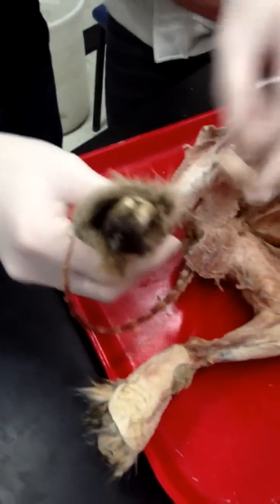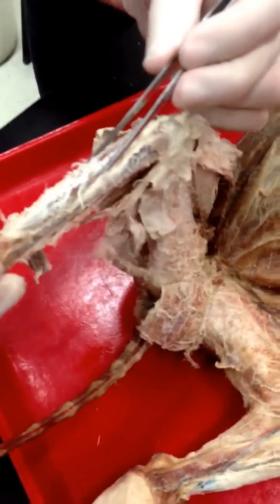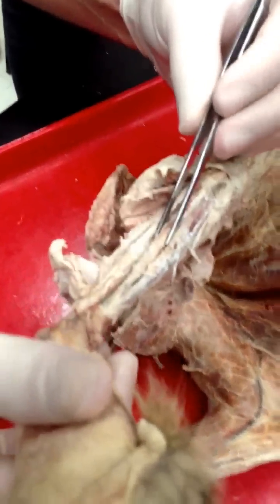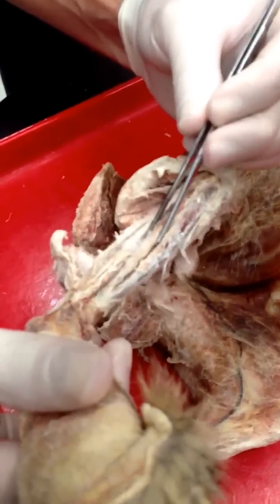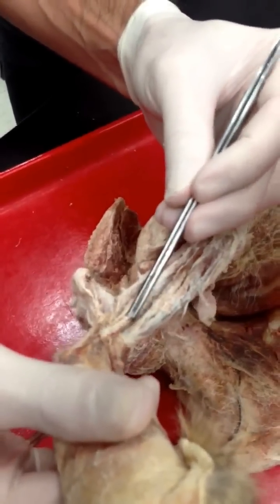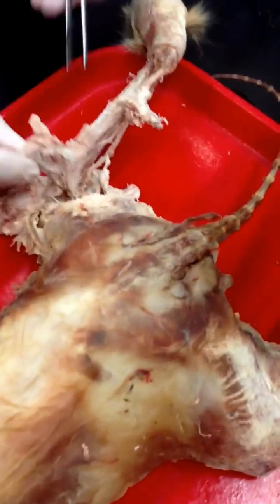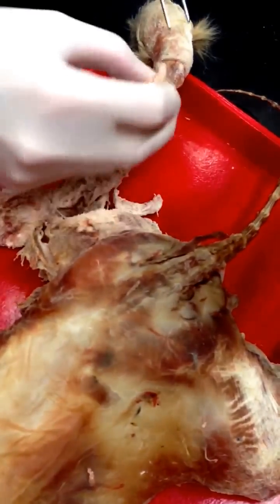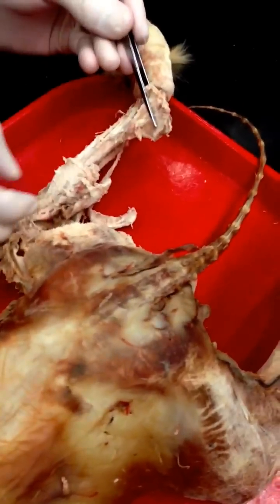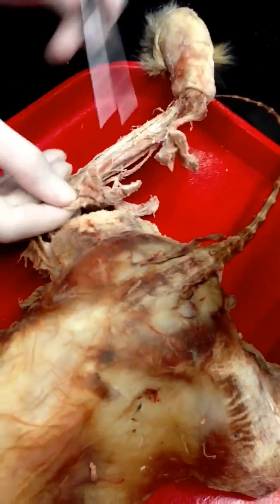And then today: tibialis anterior, extensor digitorum longus, peroneus longus, and peroneus brevis. Gastrocnemius, plantaris.